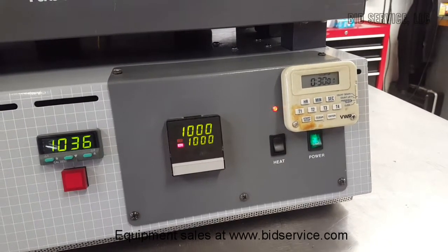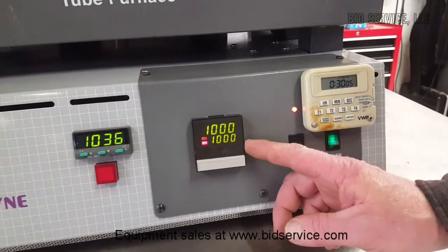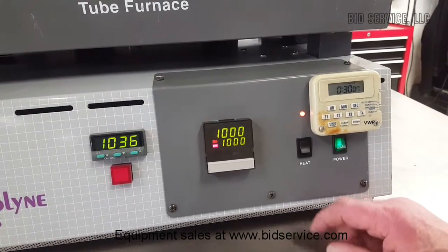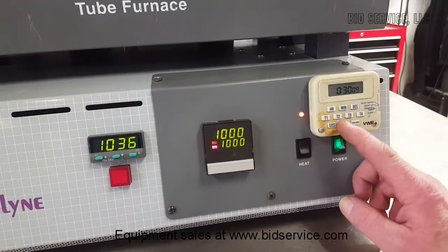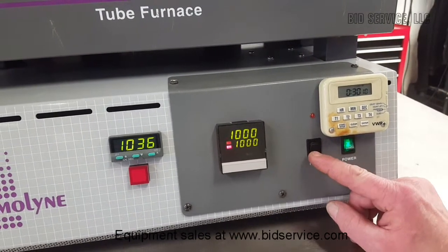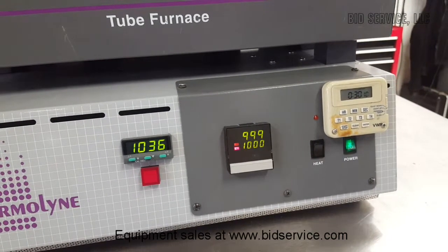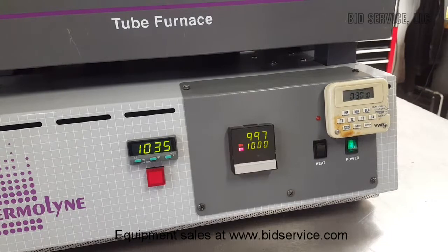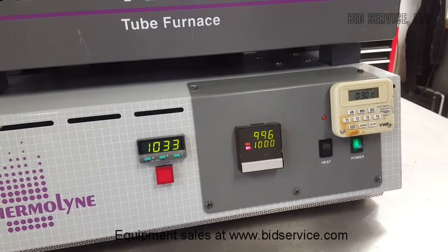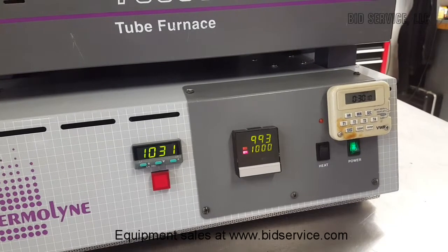Here we are at 30 minutes. It held right at 1,000 degrees. We're going to turn off the heaters — it's going to take about an hour or so, but we're going to let the furnace cool down to room temperature again, and then we're going to perform this test one more time. We'll be back in a little bit.